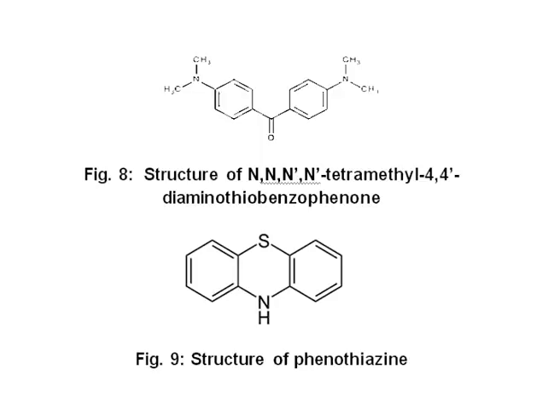Nevertheless, the quality and clarity of post-treated fingerprints are not affected. Iodine developed fingerprints on thermal paper may also be fixed by spraying with a hexane solution of N,N,N',N'-tetramethyl-4,4'-diaminothiobenzophenone, as has been shown on the figure, or phenothiazine, as has been shown on your screen. With the former, the color of developed prints changes to blue, while with the latter, reddish impressions are obtained.